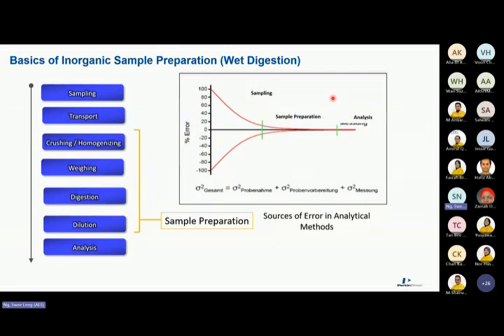That's why in inorganic analysis, you have no way to run away from sample preparation. If you introduce a solution to the ICP, most of the time the error in the instrument part is already reduced. But at the front part, it's very important to have very good sampling. Your sampling should be representative, because sometimes your rock is very big, but at different areas of the rock the concentration may be different. So they grind it to powder, and the homogenization will give you a much smaller error.